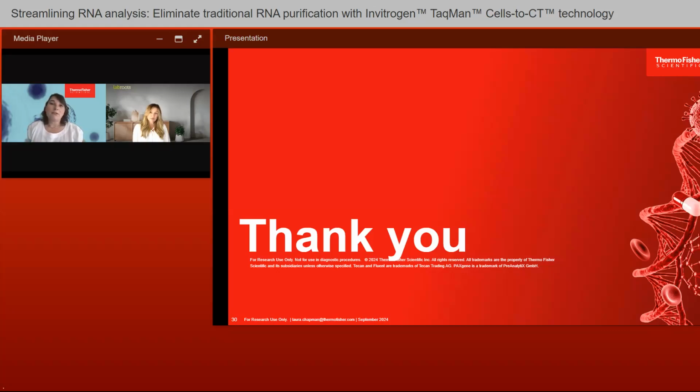The other thing is that you could look for specific cell lines of the cancer that you're researching, and then potentially look to see what potential drugs could affect the gene expression, or if there's anything else that may be interesting with gene expression from the particular cell line that you would be interested in. You could use it for that. So those are the applications I can think of off the top of my head. I think probably a screening type of workflow would be the best option to use for oncology.